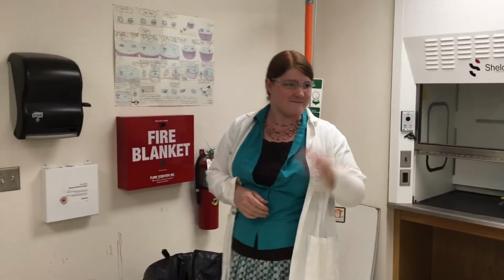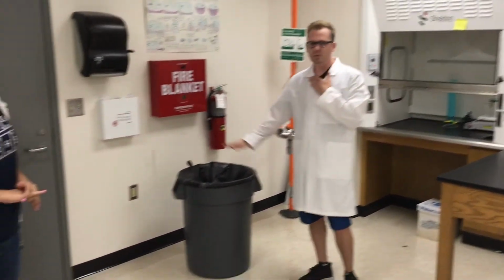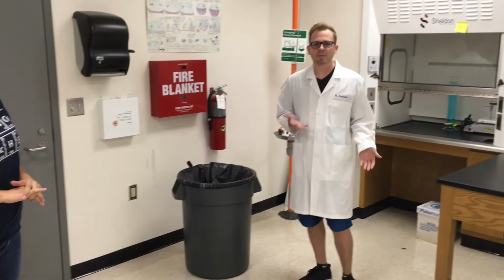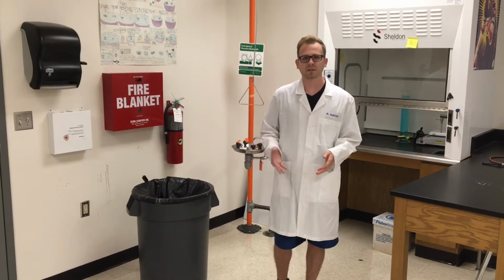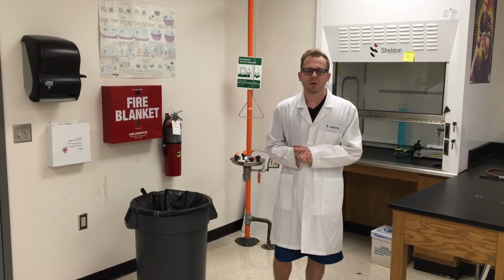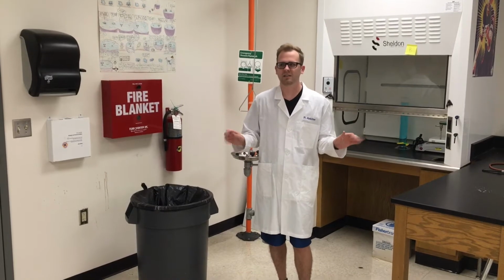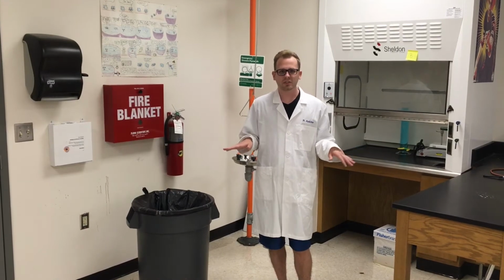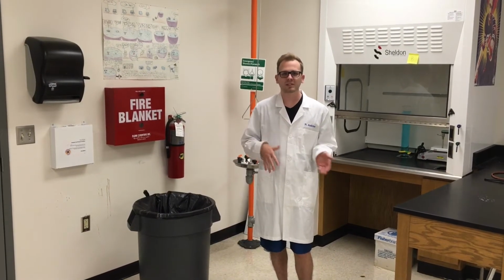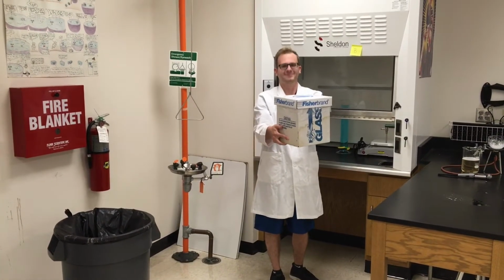All right, now, with every type of lab, we do have waste, and so we will direct where the waste and everything needs to go. But typically, your solid waste will go into the large trash can, and any type of liquid waste is able to go down the sink. But we will always tell you specifically if you need to put it in any type of container or anything else going forward. So that is pretty much waste. If you also do have broken glass, which may happen during the school year because glass just typically breaks every so often, first thing to do is tell your teacher, and then we'll direct you how to clean it up afterwards. And then we will typically put it into this very fancy glass box and get rid of it then.